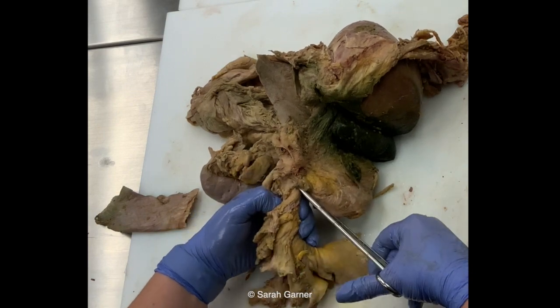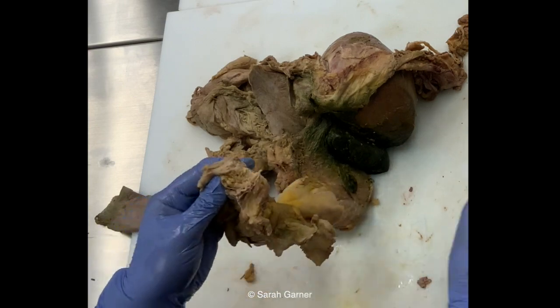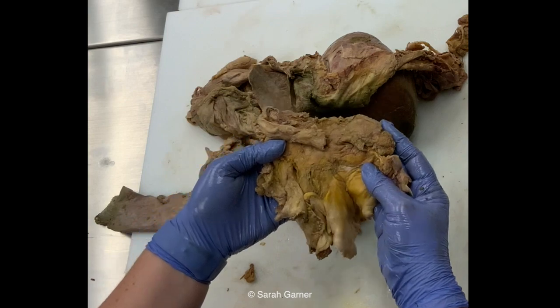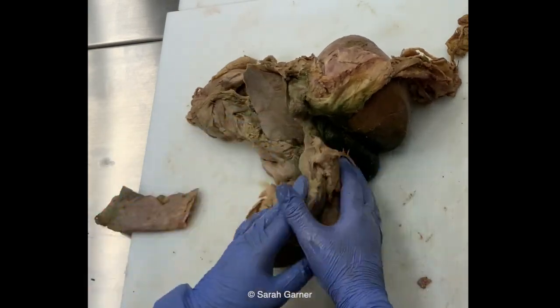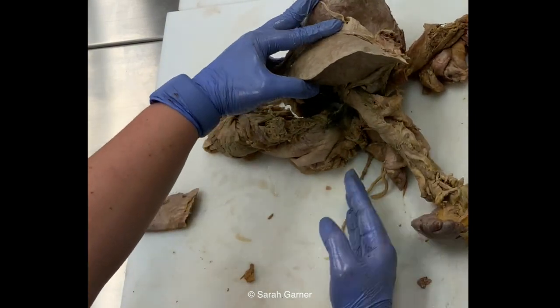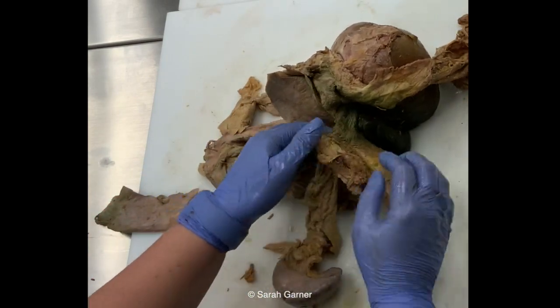You should probably section through it and note if there's any thrombi in any of the vessels, especially if you saw dusky areas of bowel, but otherwise you don't need this. So at this point, we're almost clear. Depending on what you need to do and what you're looking for, you may need to keep this intact to do a dissection, or you can go ahead and separate them. It just is gonna depend on the individual case.